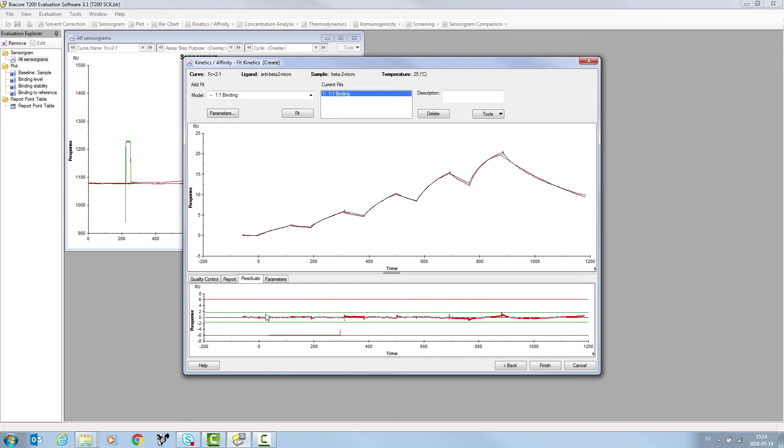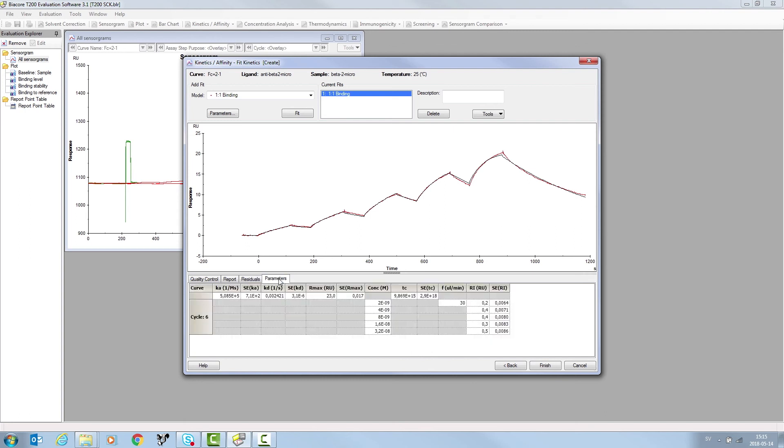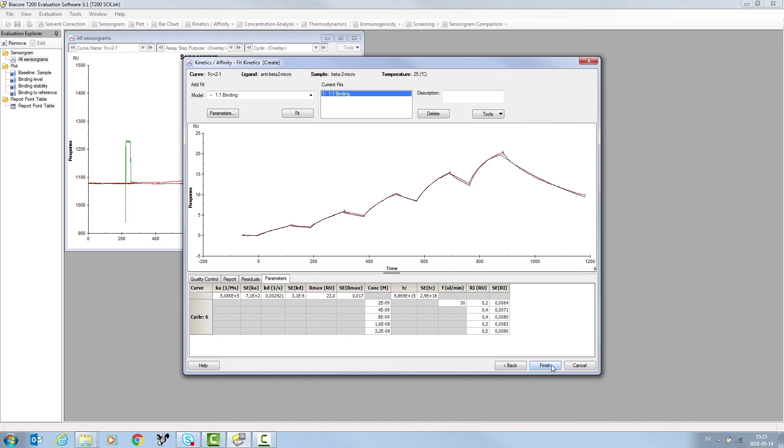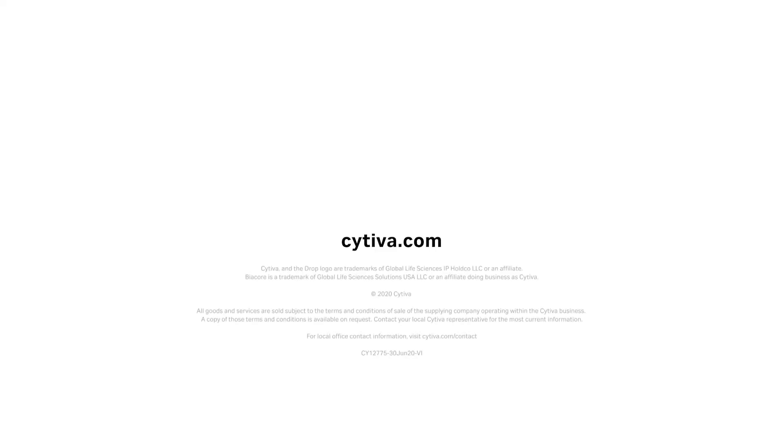In the parameters tab, you can check the confidence in the measured parameters. Standard error values are displayed for the association rate, dissociation rate, and rmax. We recommend the standard error value be ten-fold less than the measured parameter value, to ensure confidence in these parameters.